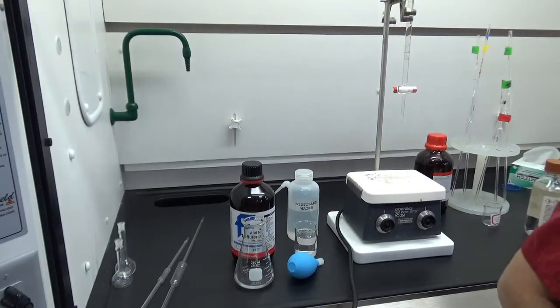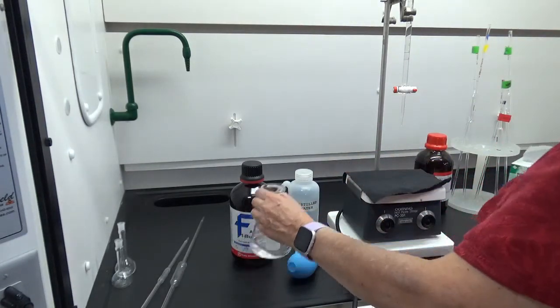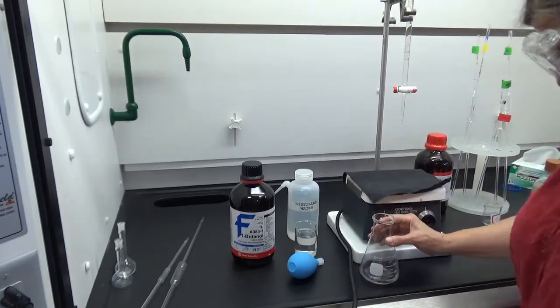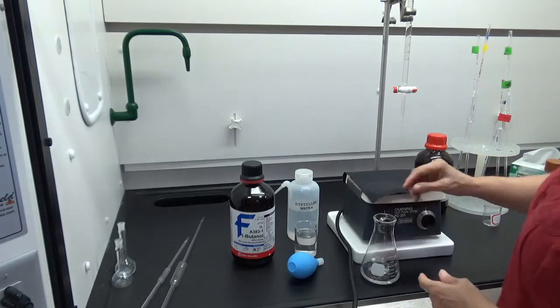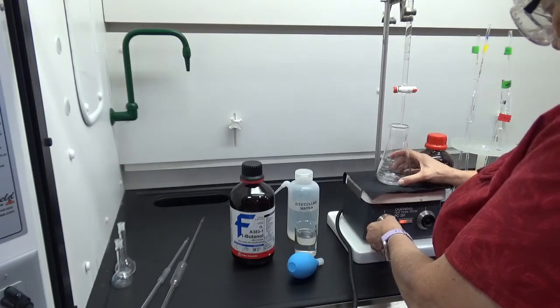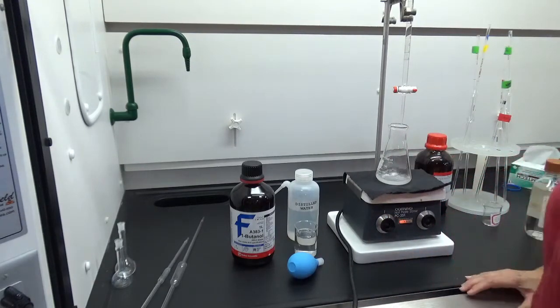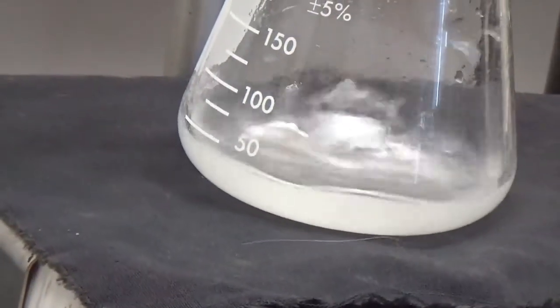I'm going to get a piece of black cloth. I'm going to put right here. I'm going to get a stir bar. Right here. Stir this up. And what I'm hoping is that you can see that it's cloudy. This tripod is not the greatest. All right. I think you can see it's cloudy.